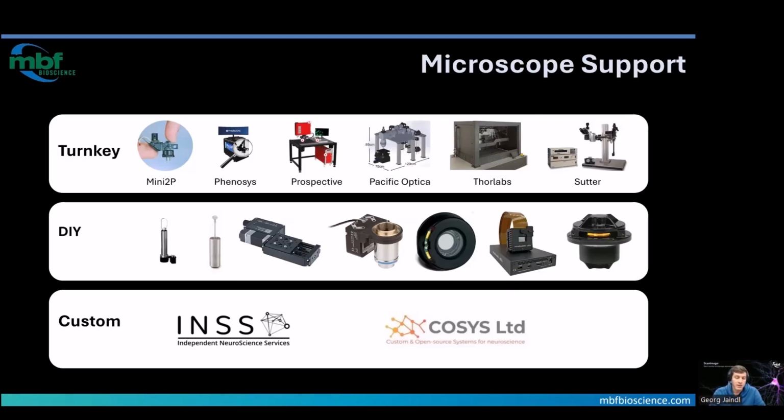ScanImage has a large library of software drivers for all sorts of different devices, including galvo mirrors, motors, objective positioners, SLMs, and so on. And you can pick basically your devices, put them all together, and then configure in ScanImage which devices you want to use and control the microscope that way.